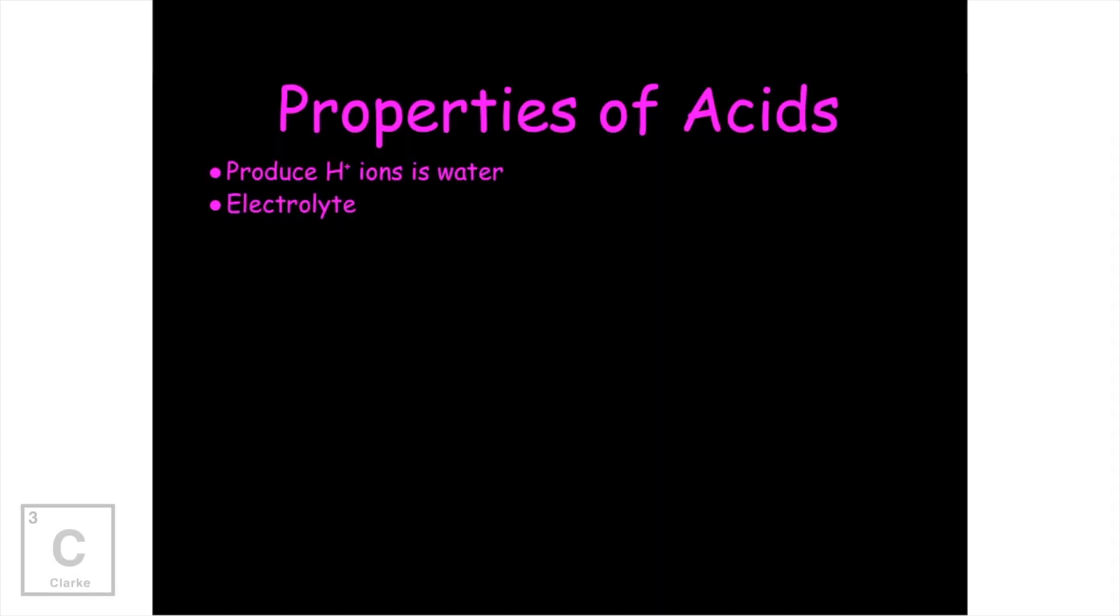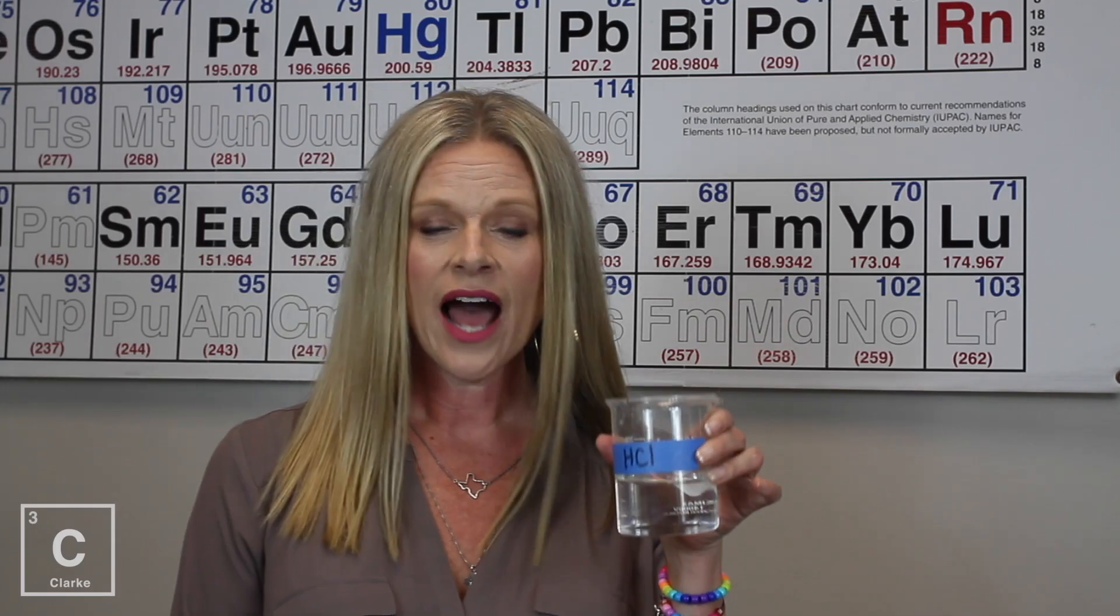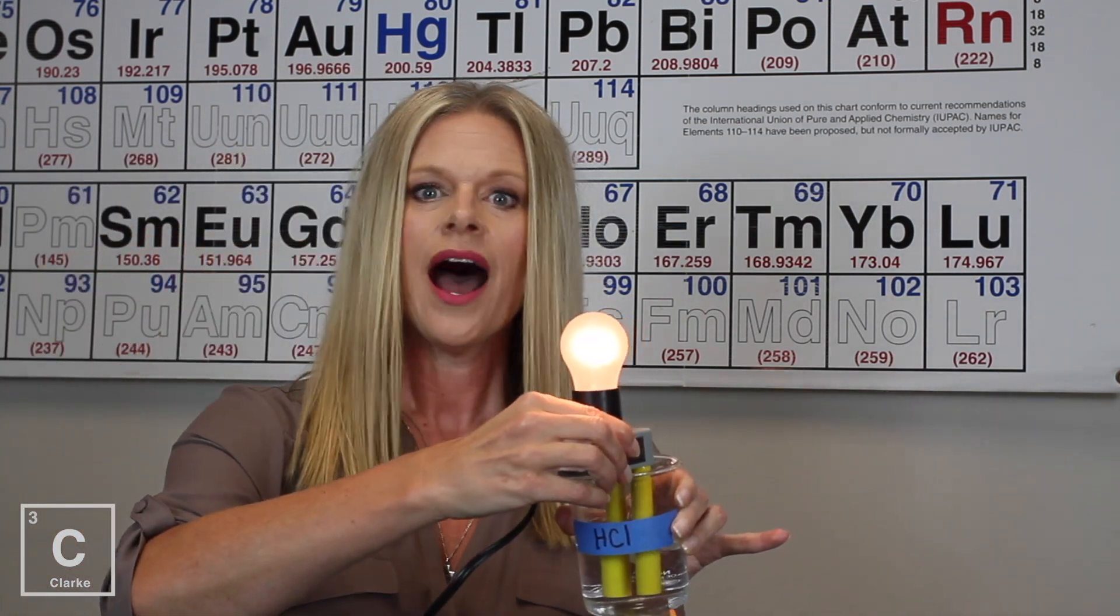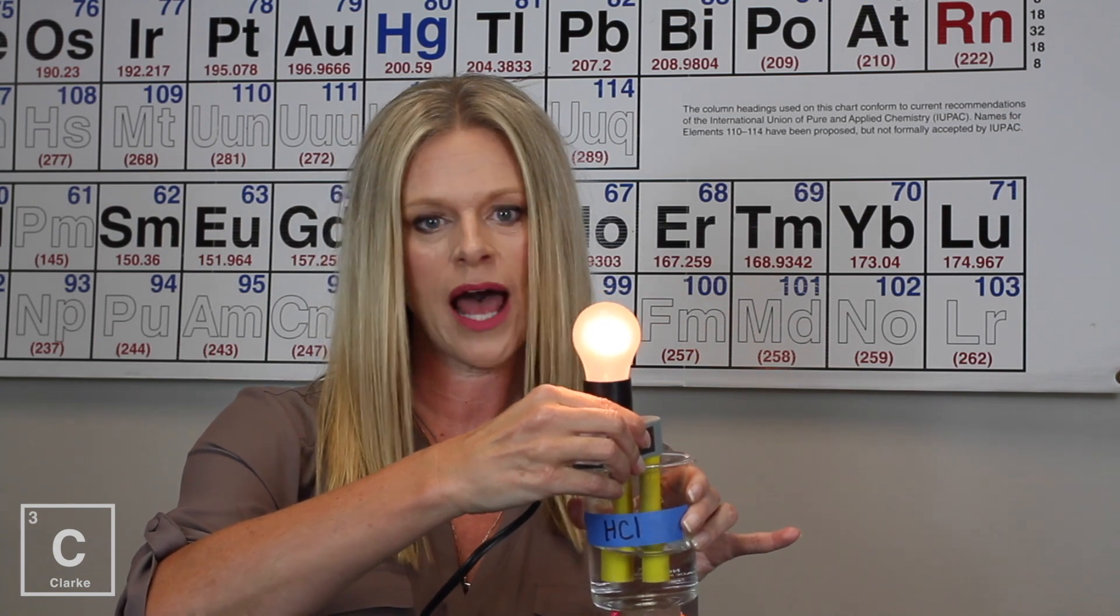Since acids do release those positive hydrogen ions, they're going to be electrolytes. Let me show you. So I've got hydrochloric acid here, HCl, my little conductivity tester, and oh look, hydrochloric acid, that is an electrolyte. When you have a compound that dissolves in solution and it dissociates and releases those charges, those charges help conduct electricity. Acids conduct electricity. They are electrolytes.